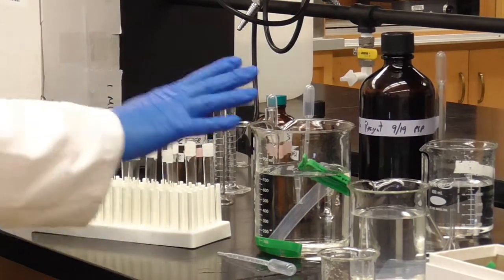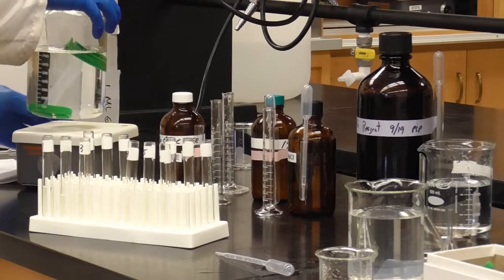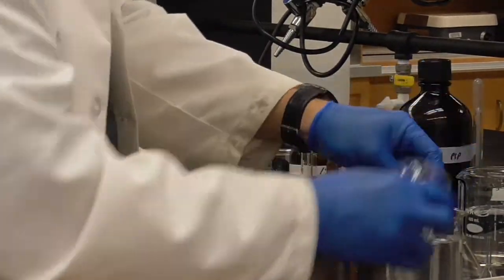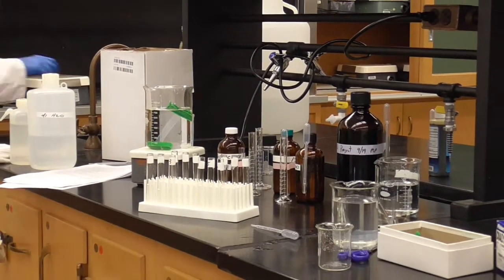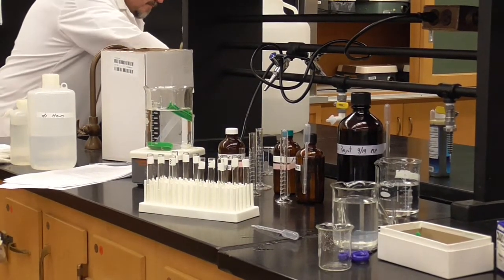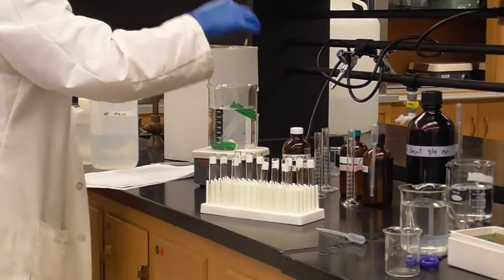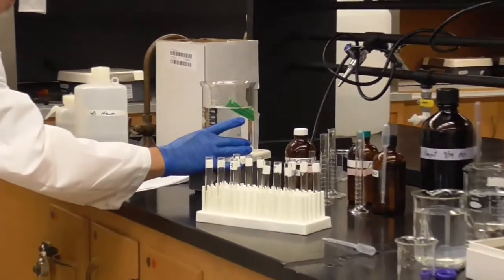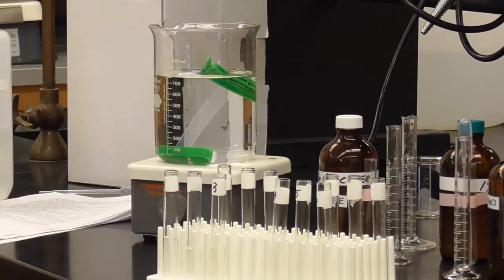I'm going to take this, put it over here on our stirrer, and get my stir bar out. Let me rinse this off very quickly with the DI water here. And drop that down in here. And just very gently turn it on, just to kind of keep it stirred up. There we go. Okay, so we are dialyzing.